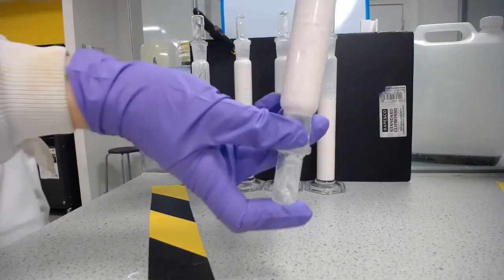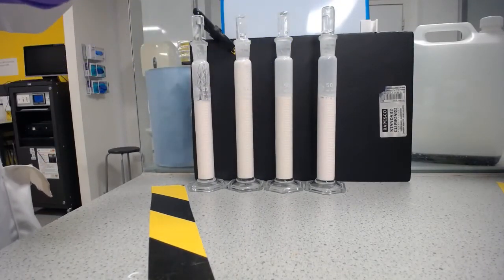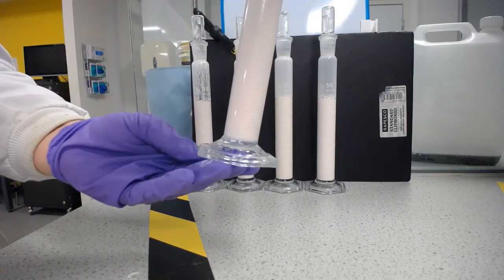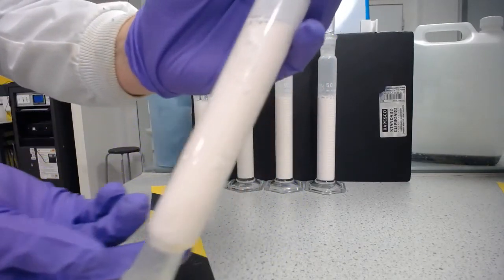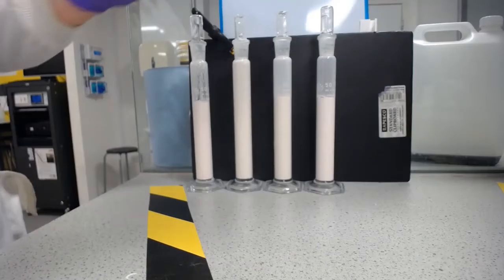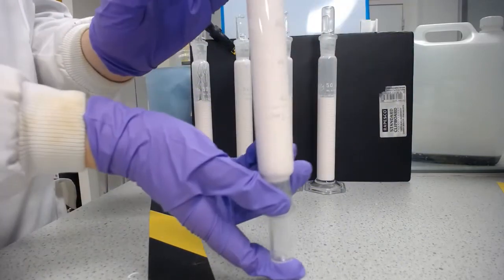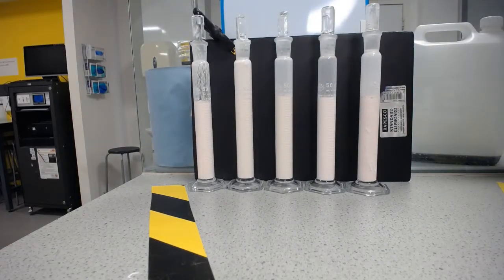Final one, this one. I'm just looking at more closely because I think if we look just at the bottom there, we can see there's some powder not resuspending there. So that's already had 3 inversions, 4, 5, 6, 7, 8. That's required 9 inversions. So we just had 1 and then 9.